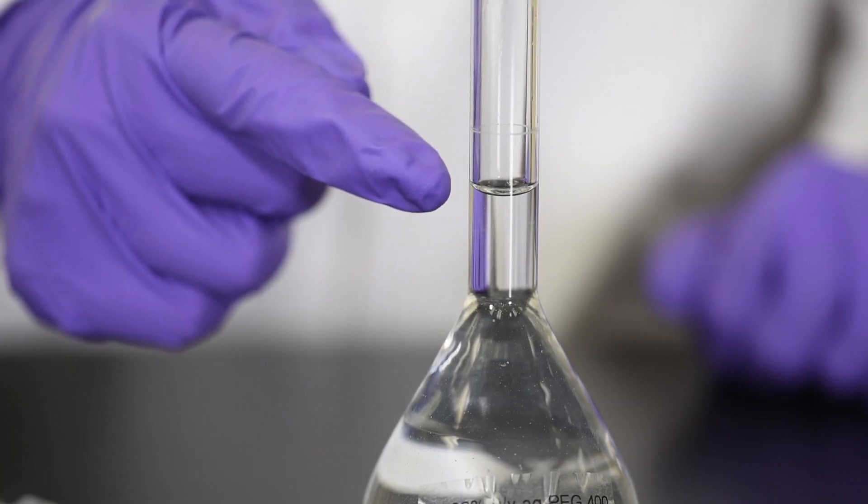While this results in a small difference in concentration that may not always be significant, it's good practice to follow the correct procedure in order to reduce the risk of error when exact concentration is needed.